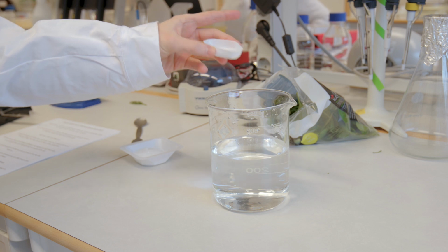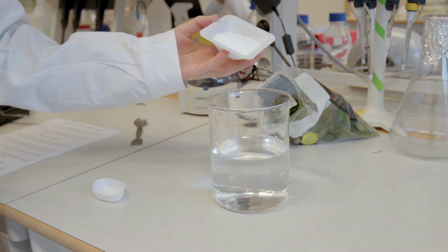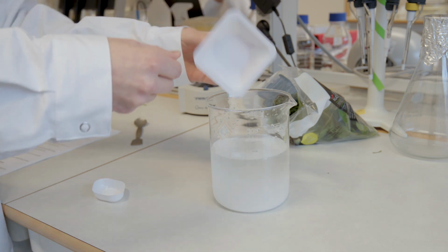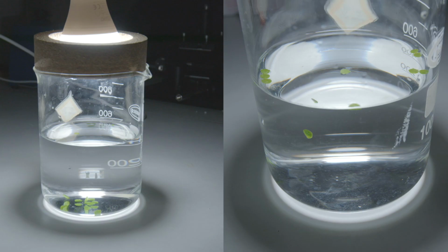What if we put no sodium bicarbonate in the solution? Or what if we put more? Maybe a lot more. What happens to the floating leaves when we turn off the light after the experiment? Do you think that they will keep floating? Or will they sink? What would be using up the oxygen that they made?